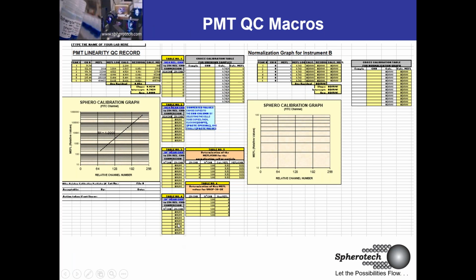So you would regularly put in your 6 or 8 data points. You will get this converted value. And you're looking in here for an R squared. If you want to write down a good R squared, you're going to want at least 99.2. I would shoot for a 99.5, right? A 0.05% confidence level usually makes me pretty happy. We like to beat 99.7 in most channels. There's only 1 or 2 channels that should give us any trouble.